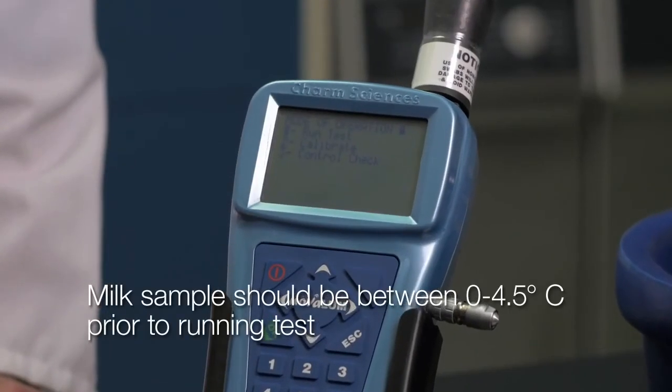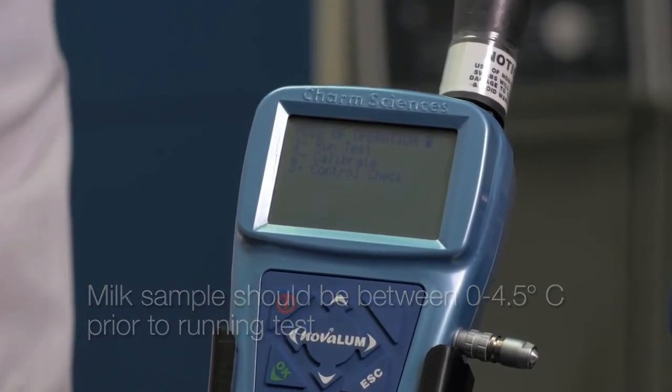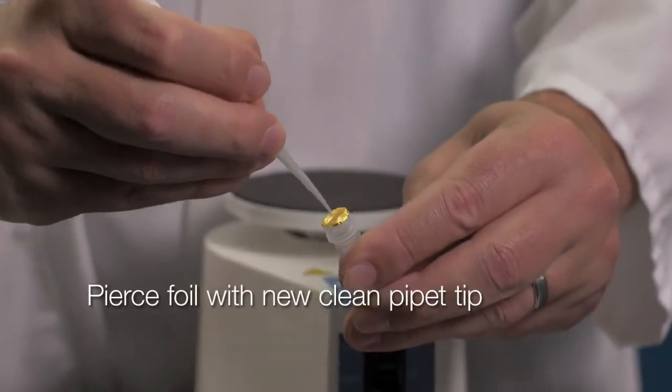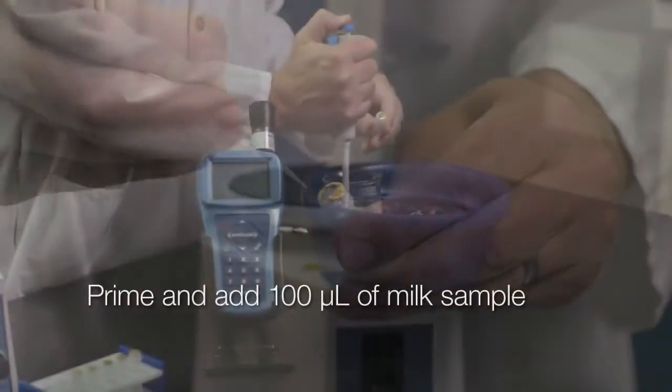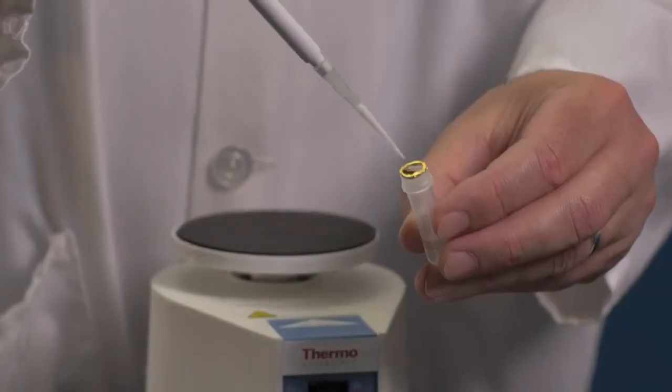All milk samples when tested should be between 0 to 4.5 degrees Celsius prior to running the test. Using a new clean pipette tip, pierce the foil top of the FAP vial. Prime a pipette tip with your sample and draw 100 microliters. Inject the sample into an FAP vial.